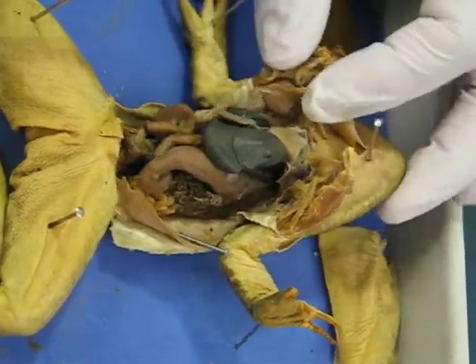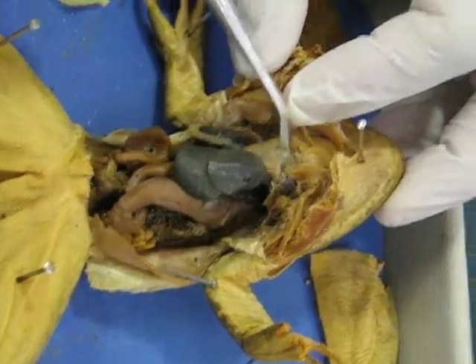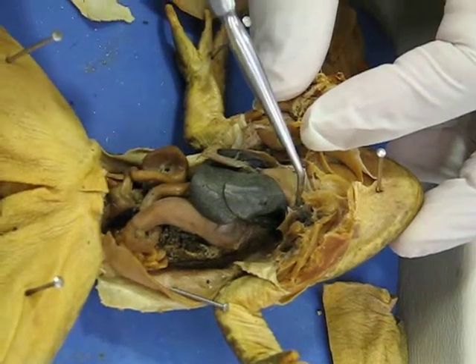We have the heart, which is made up of three chambers. You can see the ventricle. And then above those, you have two little sacs on the sides — those are the atrium.